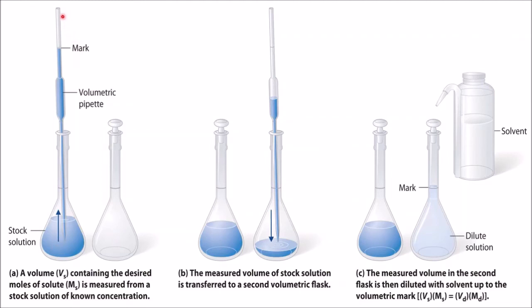You use a pipette and you extract your stock solution. Your stock solution is another way of saying the solution that has been known. So you can also call this the standard solution, as we called before. So the standard solution or the stock solution is basically any solution that you know the concentration of. So it means the same thing. Okay?